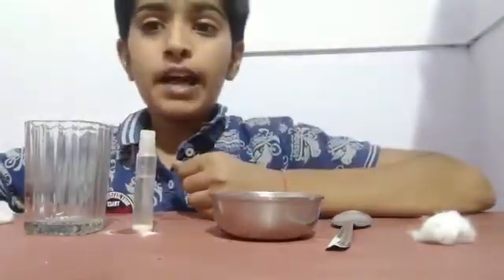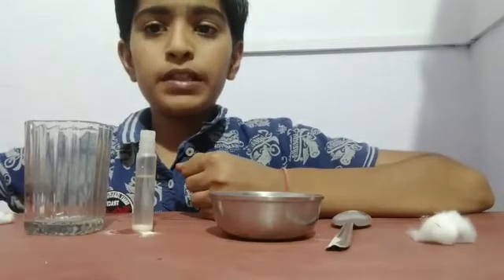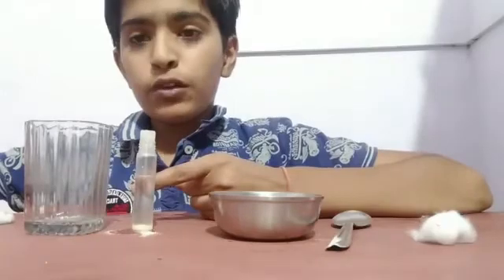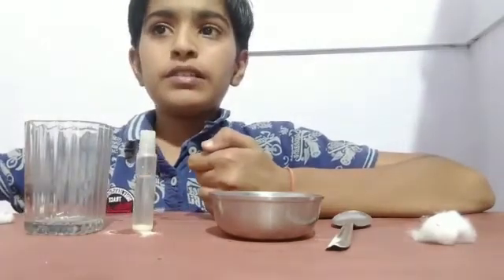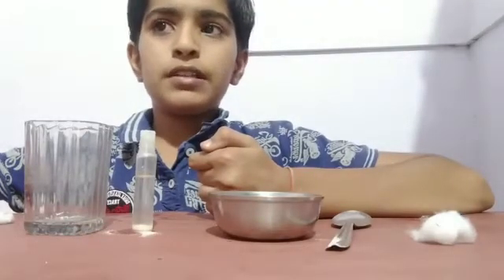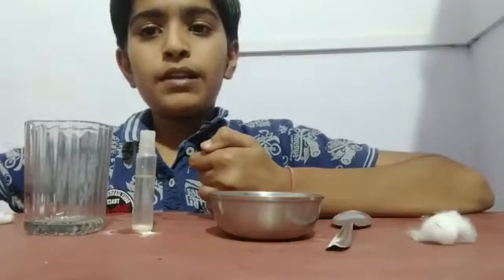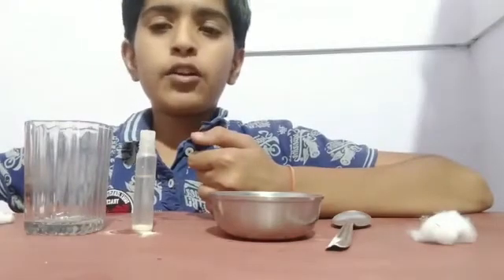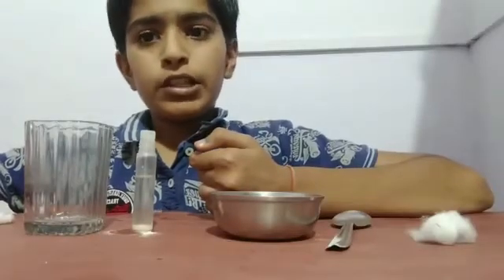It smells like alcohol with the process of fermentation and the presence of sugar water and yeast. This yeast ferments and produces an alcohol-like substance which gives the smell of alcohol. This proves that microorganisms have a role in fermentation.